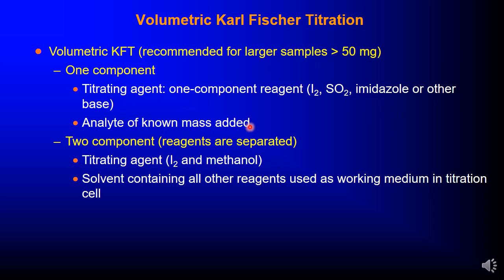So 2 component reagents are separated. Titrating agent, we have iodine and methanol. Solvent containing all other reagents used as working media in the titration cell.